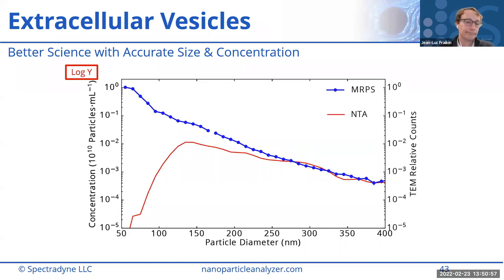It does. Just one more little question about the cartridges. I know in the past there was a recommendation to mix your sample with BSA or Tween. Is that sample prep still recommended for EVs, or what's the best practice? Yeah, we have a few different options, but definitely some kind of wetting agent is required in the sample.